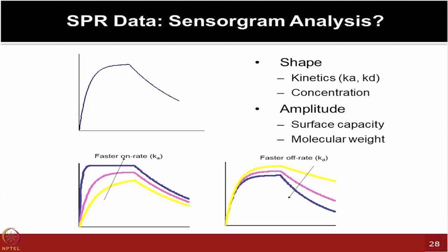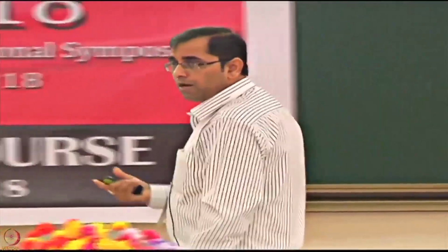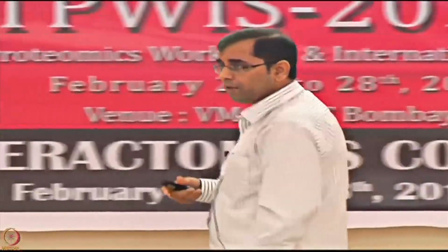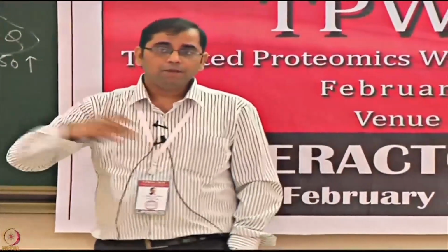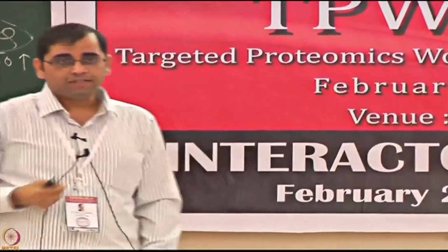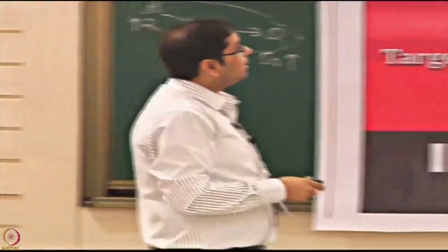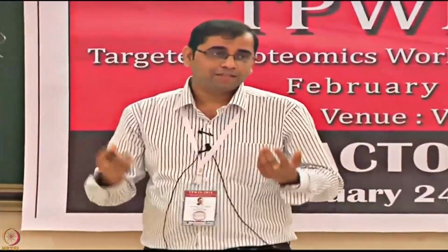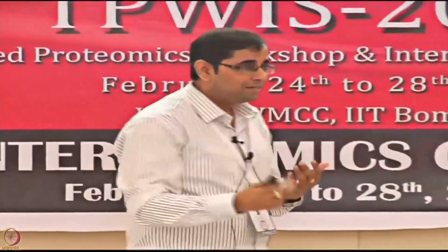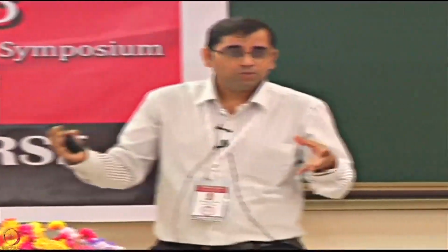So therefore these kinds of curves are very crucial as you are watching, and there are many companies who work with us, who do the testing in our labs, in our facility, who are trying to look at many of their biosimilar products, and some of this kind of testing they do. We can see from their experiments that just looking at the shapes of these sensorgram curves can make them feel excited or not so excited, because immediately it tells them it is working or not working. So all this is just visually what you are seeing.